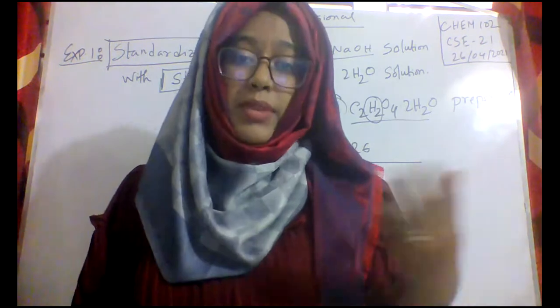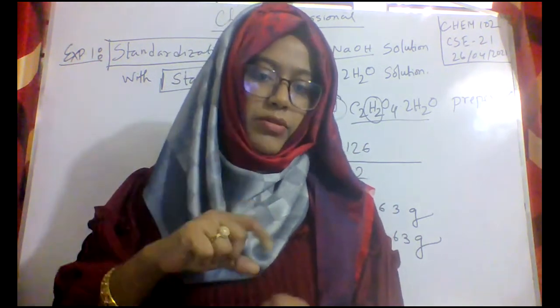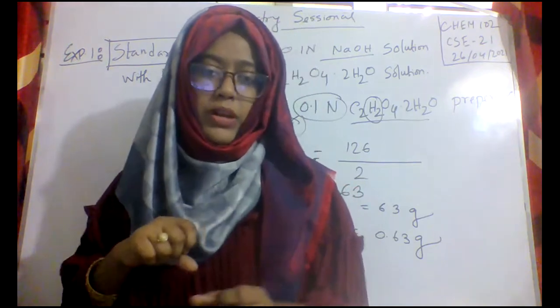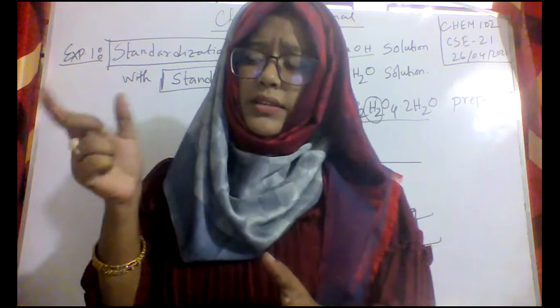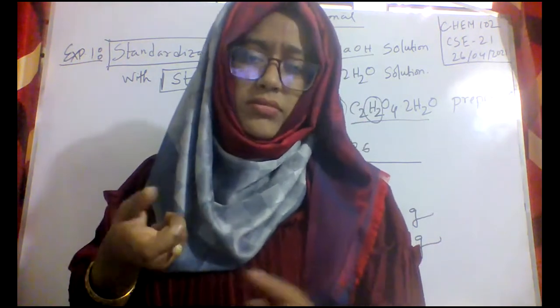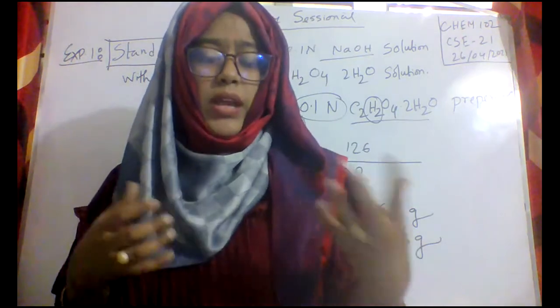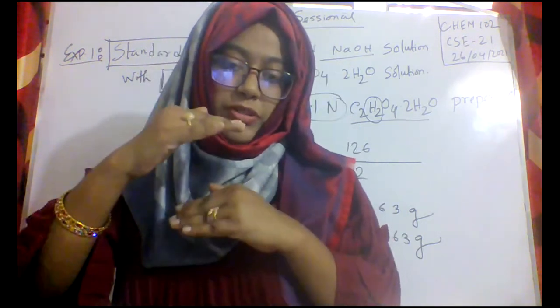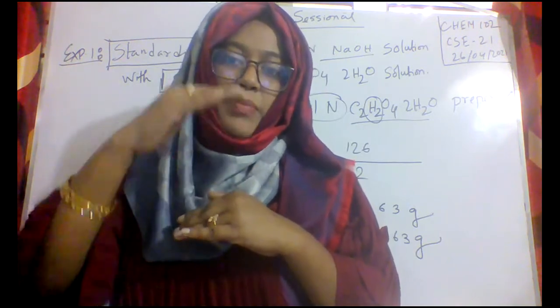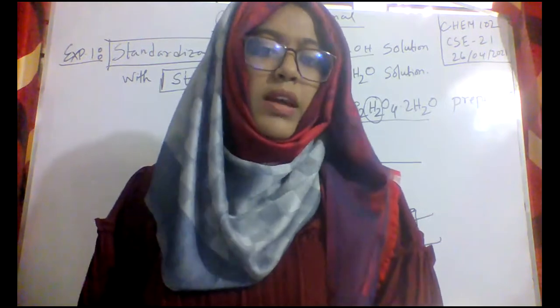We make some chemical error, like we add an excess amount of sodium hydroxide at the end point, or you can add some extra phenolphthalein. It can also make some chemical error or visible error. We cannot find the perfect volume always, lower meniscus, upper meniscus. So several types of error can occur.